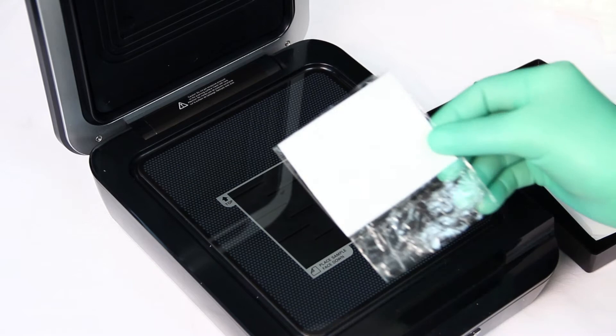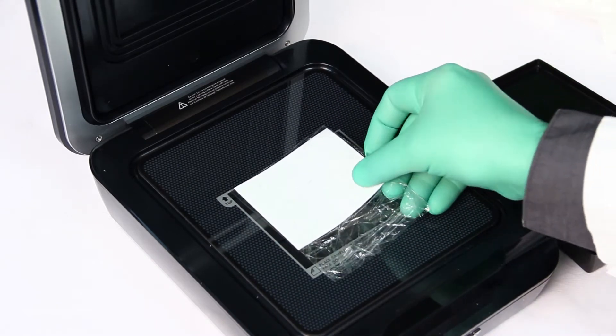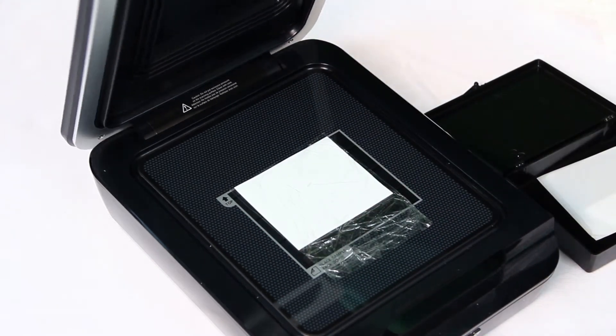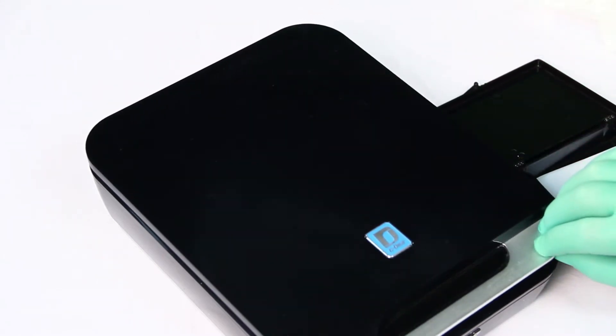If you prefer, you can wrap your blot in plastic wrap or place it in a plastic sleeve prior to imaging. The plastic wrap will adhere to the glass surface of the scanner and provide a smooth flat surface for imaging.